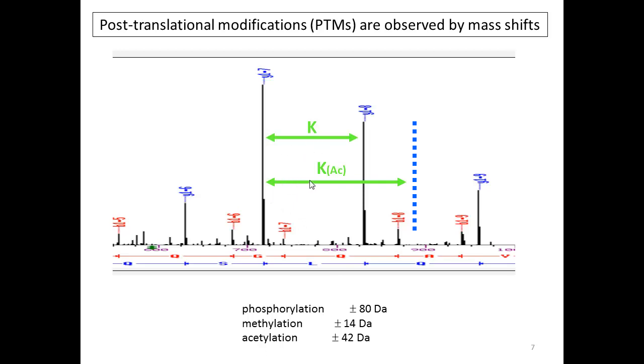I've showed the difference between a lysine and a lysine that's been acetylated. You will recall that many lysines are acetylated in the histone tail region of those proteins, and this acetylation event modulates the interaction of histones with the DNA based on electrostatic interactions, and that this is a way of regulating gene expression, turning genes on or off. Acetylation adds 42 daltons to the lysine molecular weight, which I would guess is around 120 daltons.